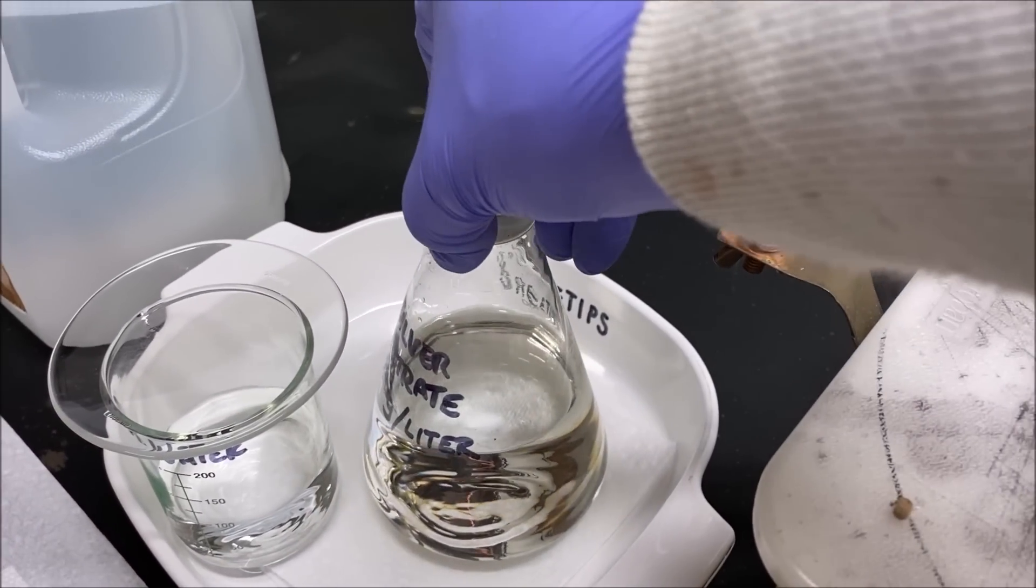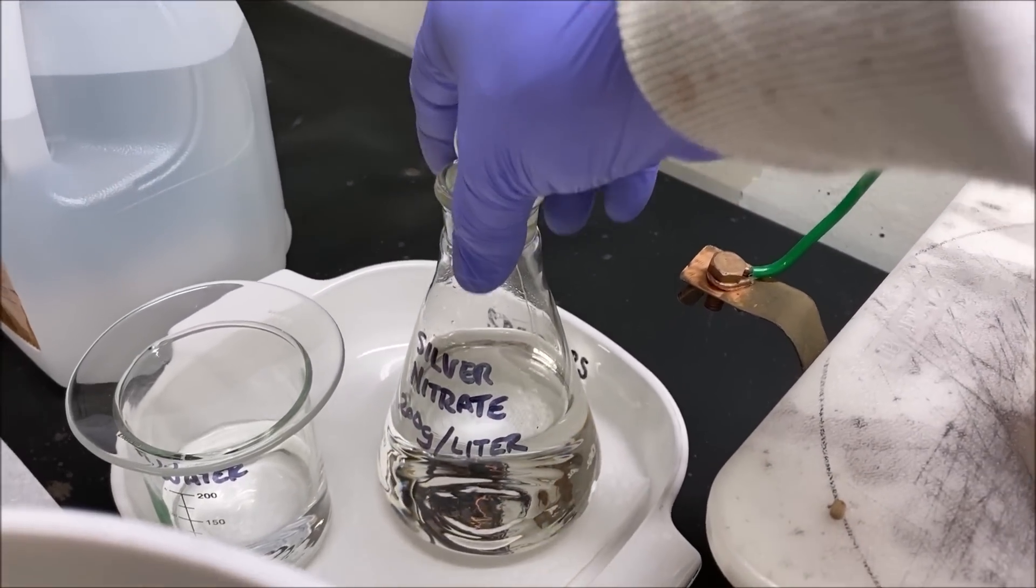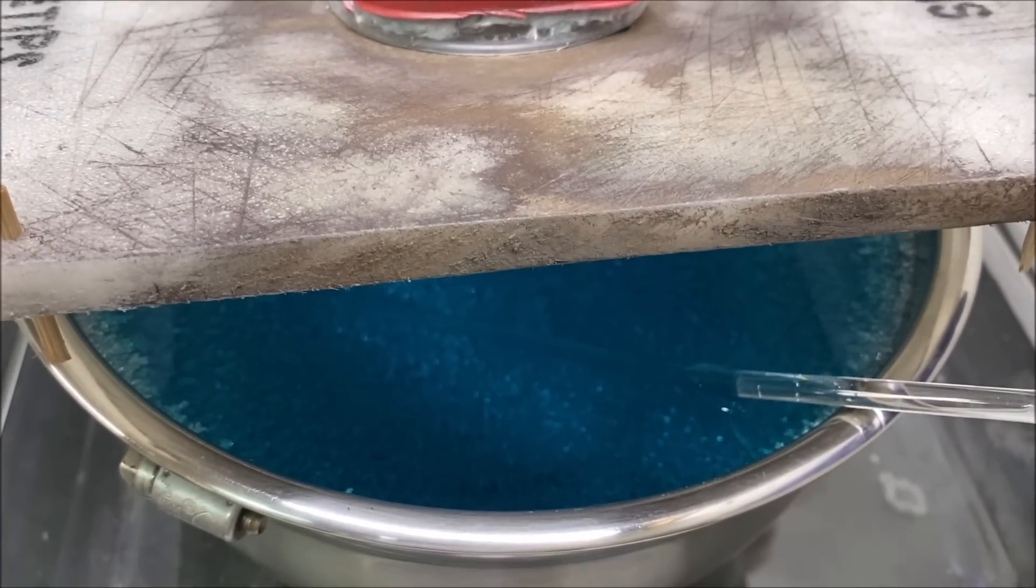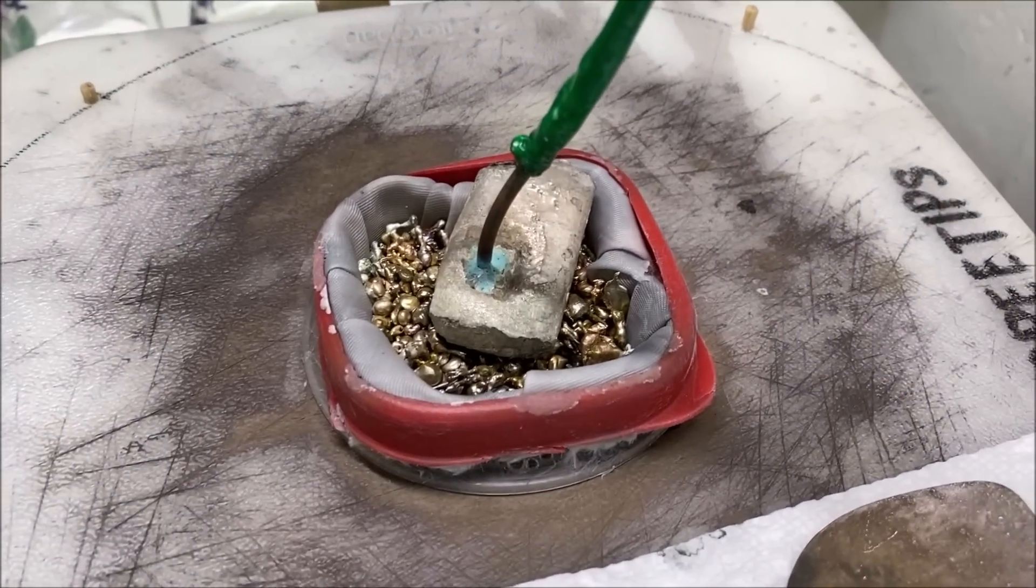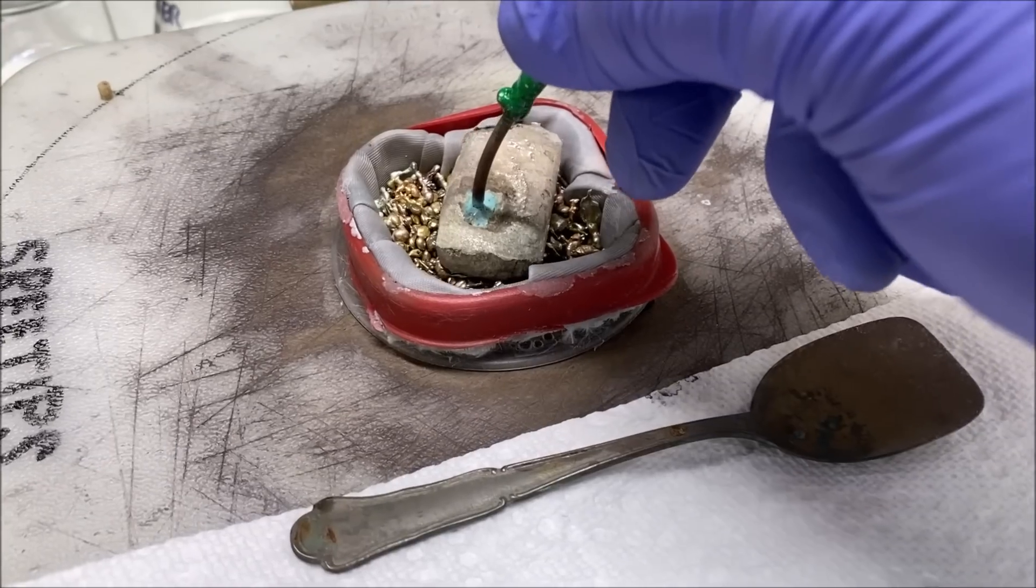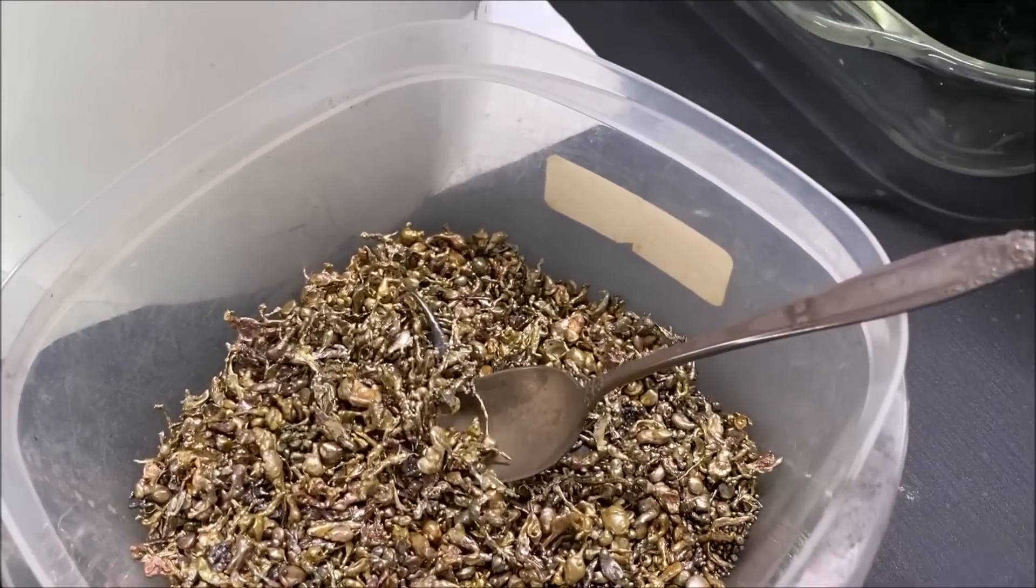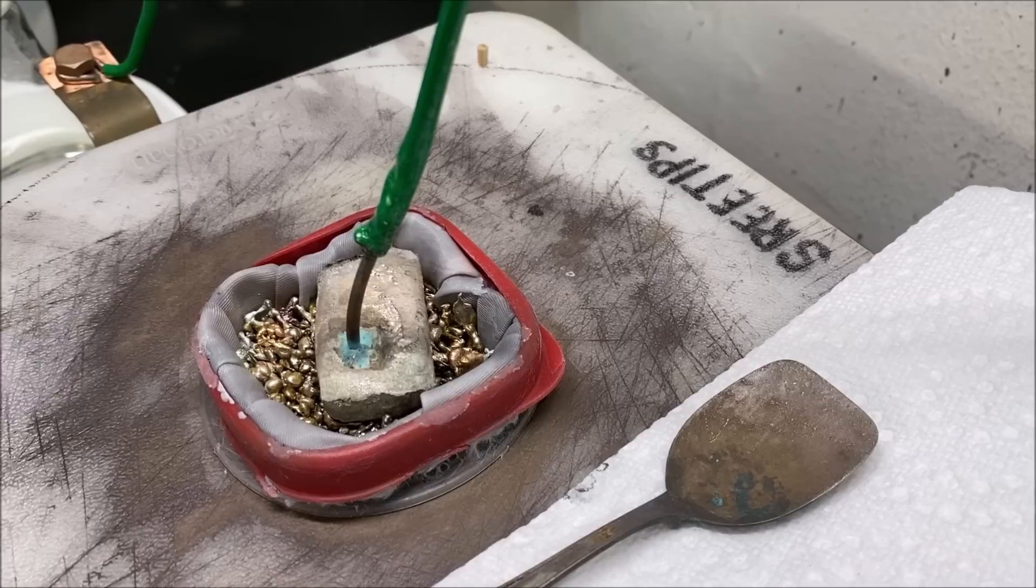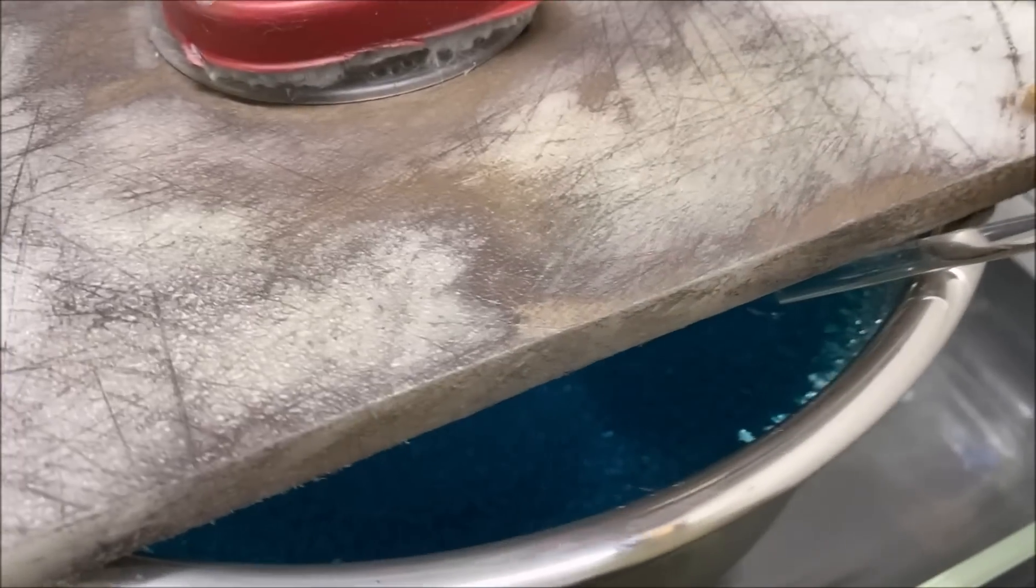Another question I get is, this is our electrolyte, it's crystal clear and colorless like water. And as we run the cell, the electrolyte begins to turn blue, as you can see here. And the reason is, this is because the impure silver that we're feeding into the anode basket has a little bit of copper in it, about one or two percent of these granules is copper. It's about 98 to 99 percent pure silver. So as the cell operates, that copper dissolves from the electric current going through the impure silver in the anode basket here, and it passes through the filter into the electrolyte. And that's why the electrolyte turns blue.